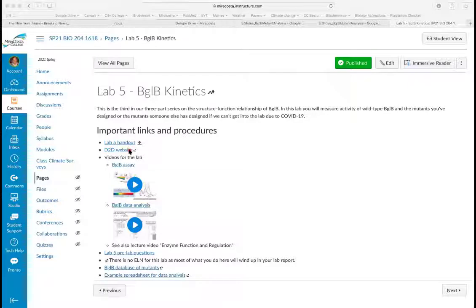There's a lot of data on that website, and I'll go there in a moment. These two videos, of course, are Susie's videos, and they go into more background and detail about the BglB assay. So watch that if you want. And let's just use my data analysis. I would not use Susie's data analysis because what I do is a little bit different, and I actually make it much simpler for you. And these, of course, are the lab 5 questions, which you've already done.